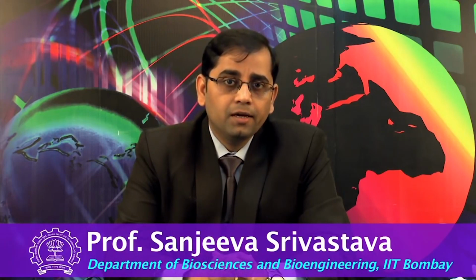In addition to just having the purified protein or antibodies printed, or even having cDNA to make chips like the cell free expression based arrays, one could also try to probe directly a specific target of interest in reverse phase protein arrays, as we have discussed today with Dr. Ramesh Umani. So, I hope today you have learned about reverse phase protein arrays, the basic workflows, how the array looks once it is printed on the chip, and the advantages of using RPPA.